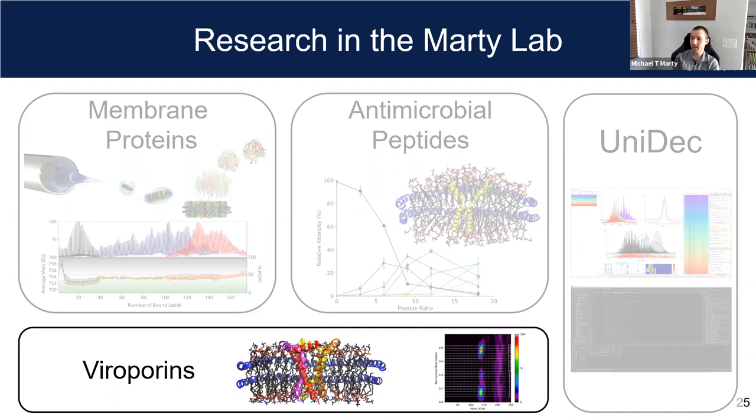But all of the protein work that we've done are with fairly large proteins. So we're using the E3 version, the bigger version. Typically the MSP1 E3D1 and the MSP1 D1 are the two best. But I think the Delta H5 works pretty well as well.